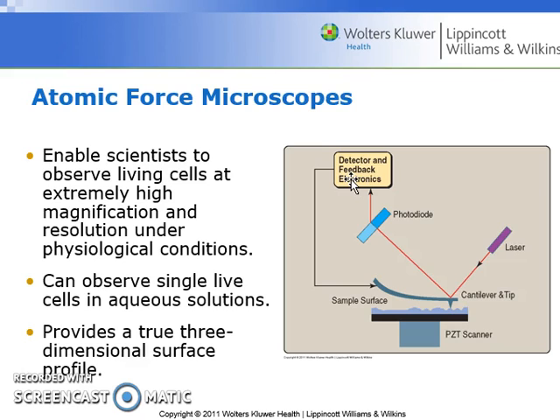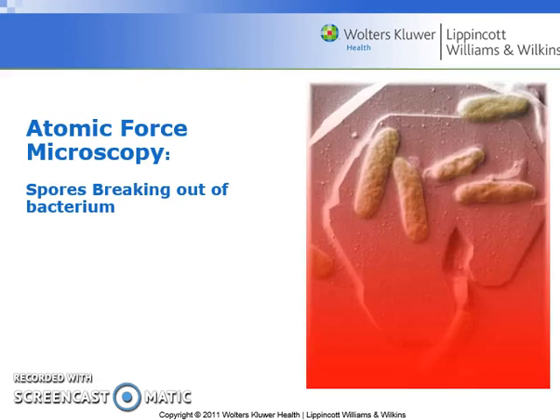So atomic force microscopes are high-powered, and they're used primarily to help us visualize living cells using very high magnification as well as high resolution, typically under physiological conditions. And here's our final image. Here's an image of some spores that are breaking out of a bacterium.